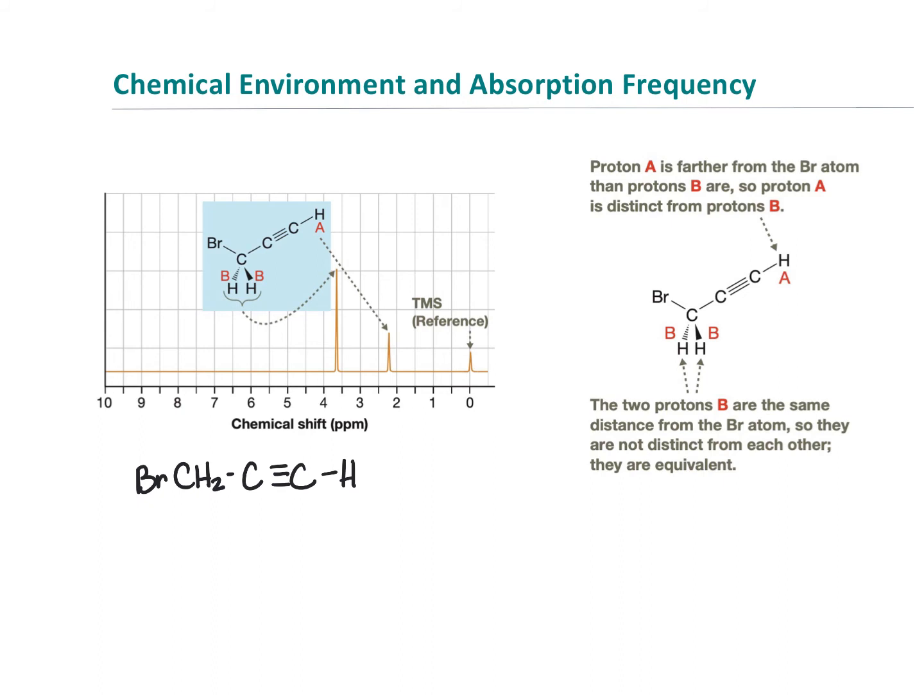I see first off there's no symmetry. Those hydrogens right there are on the same carbon. And as long as there's no cis and trans or anything unusual, if you have hydrogens that are on the same carbon, they are going to be in the same chemical environment.